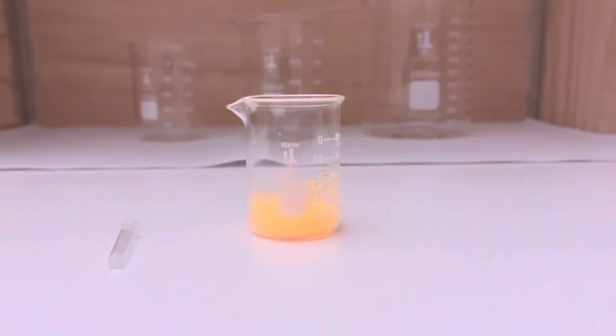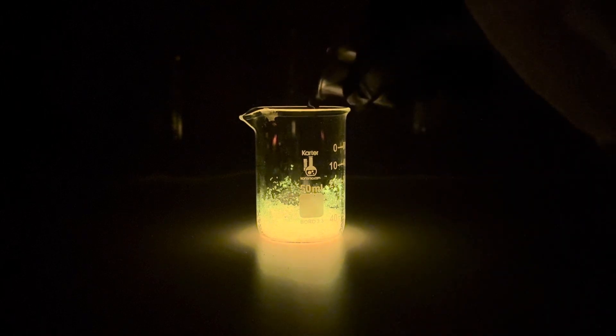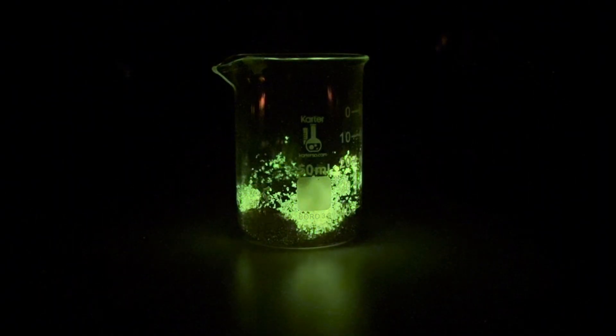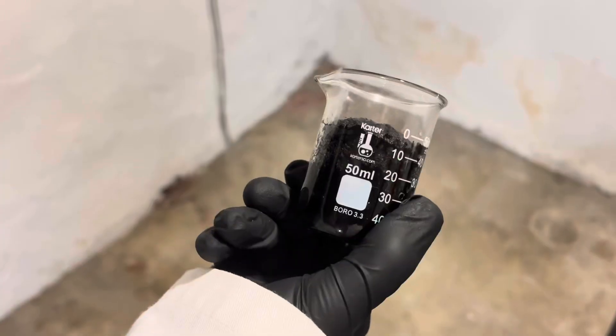Let's add the sulfuric acid. I'm hoping this carbon snake will glow as it grows. It looks like the intense acid reaction is breaking down the glowing compounds in the sugar, stripping its light away.